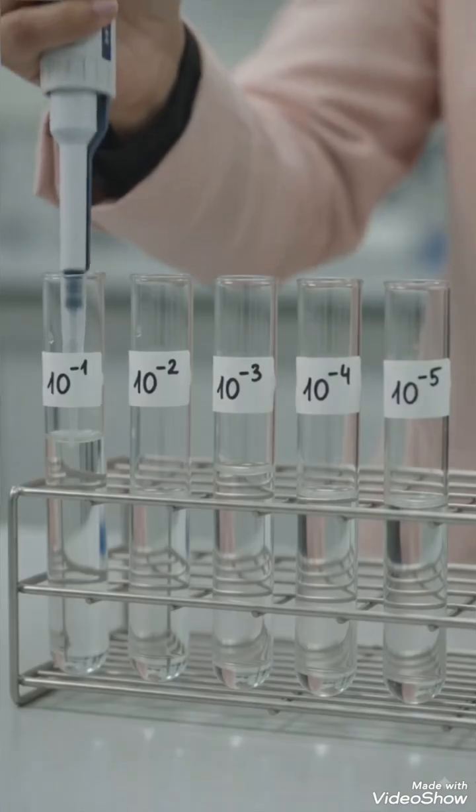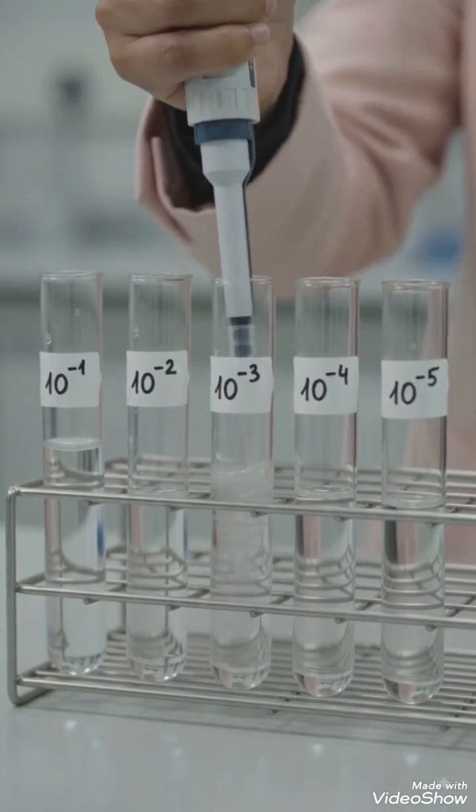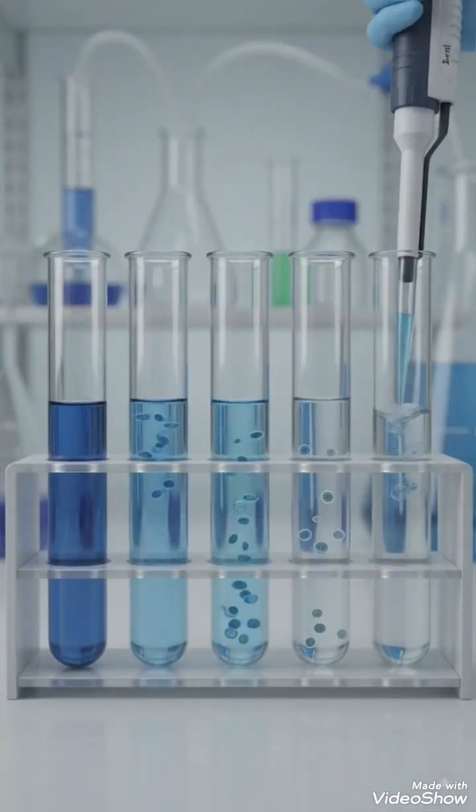Transfer 1 milliliter from the first dilution into the next tube containing 9 milliliters of diluent. Mix thoroughly. Repeat the process until the required dilution is achieved. Each transfer reduces the microbial concentration by 10 times.